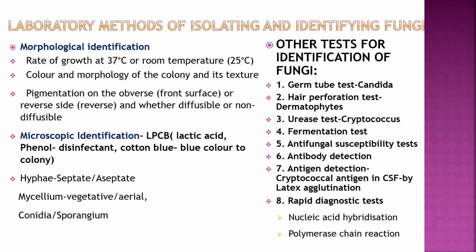Microscopic identification: an LPCB mount is done, that is lactophenol cotton blue, containing lactic acid, phenol, and cotton blue for the blue coloration. In that we can see hyphae that are septate or aseptate. Aseptate hyphae are seen in Mucor, septate hyphae in dermatophytes. Also mycelium, vegetative or aerial, conidia or sporangium.